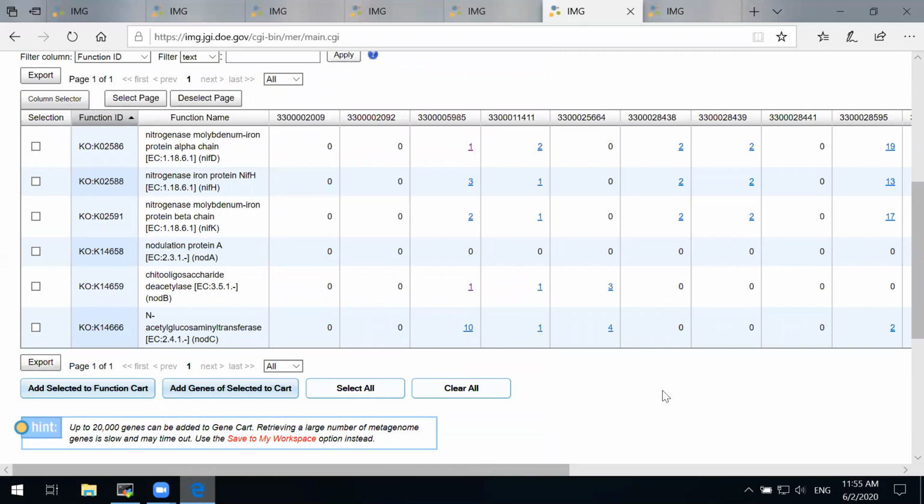So we do have the nitrogen fixation and nodulation genes in the remainder of the metagenome, from which we extracted this bradyrhizobium high completeness metagenome bin. These genes for nitrogenase and nodulation were not assigned to the bins for multiple reasons.